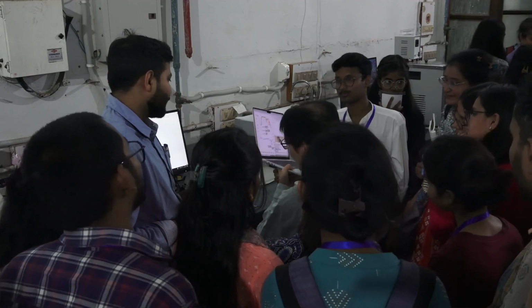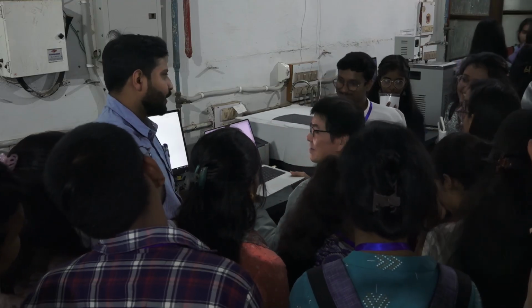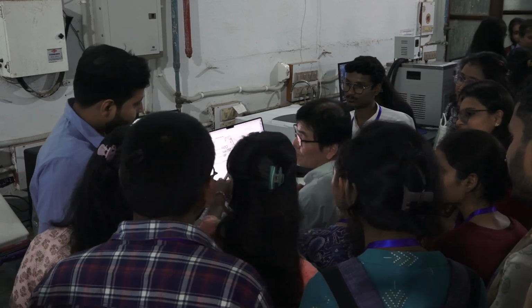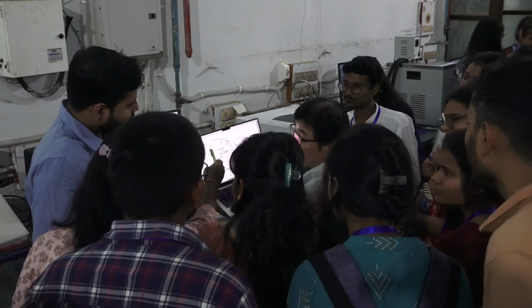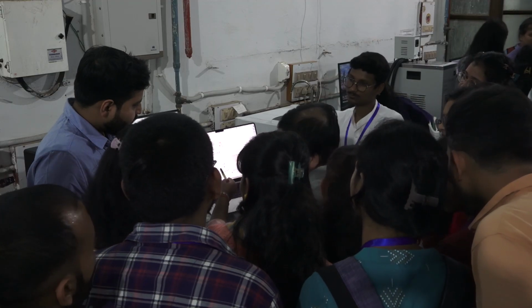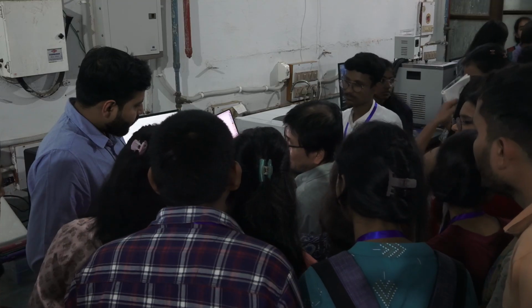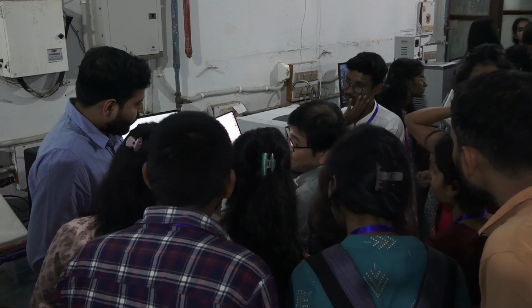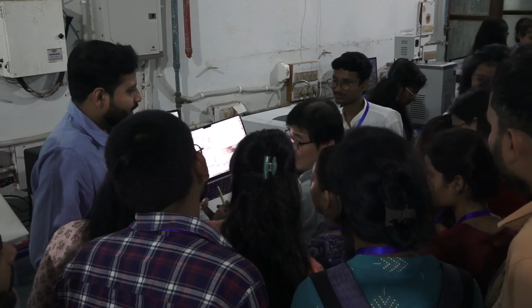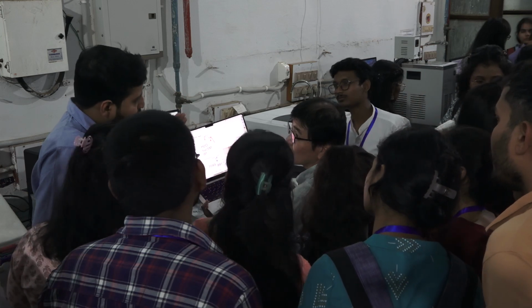Okay. So please try. Can we get this difference spectrum by plotting in Origin directly, subtracting A from B? I calculated diff is equal to. My question is, can we get this spectrum by using Origin? I have never used Origin, but just subtracting the y-axis, we can get it.